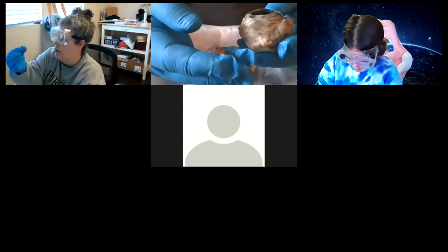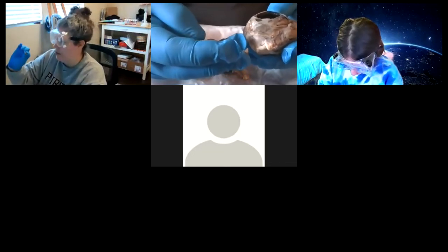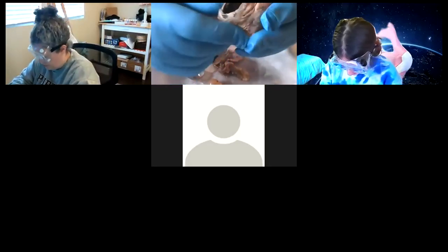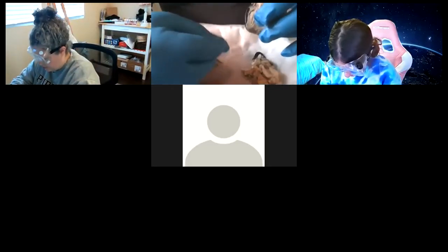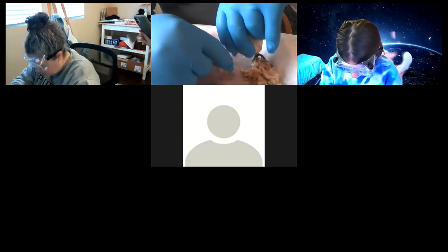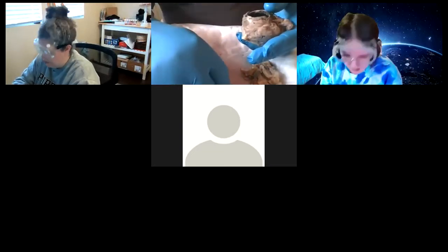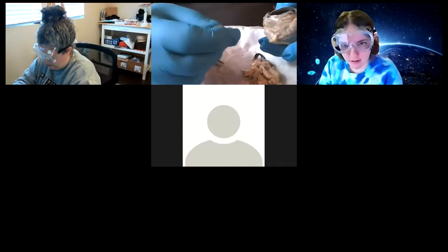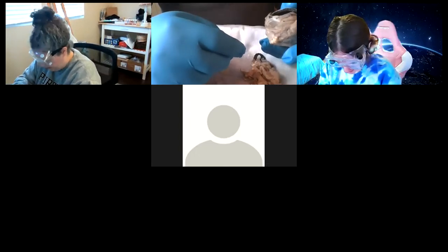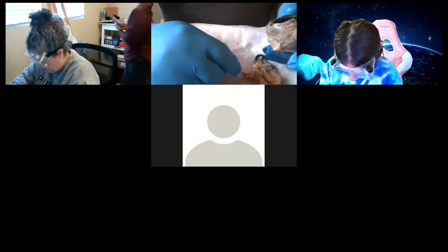So that's where I'm at. Be careful you don't squeeze that into your face and keep your mouth closed. Once you take the lens out, look inside and make sure you see the vitreous humor and squeeze it out. That little pebble-like thing is the lens. Would ours feel the same way? In a living eye, the lens is very soft and pliable — this is a dead one. In our eyes, it's organic material, a crystalline protein.